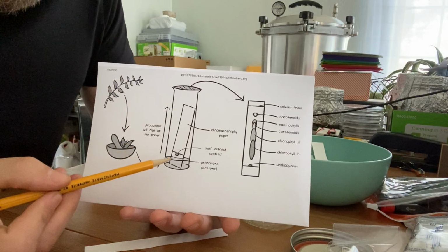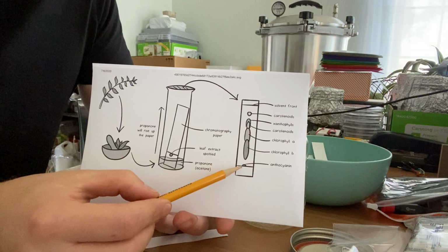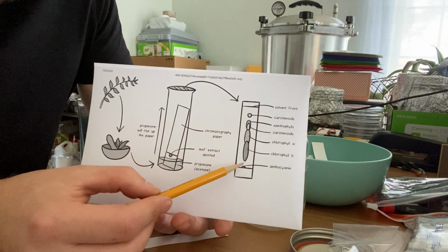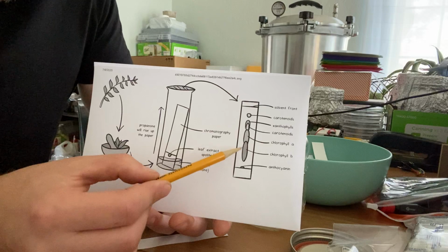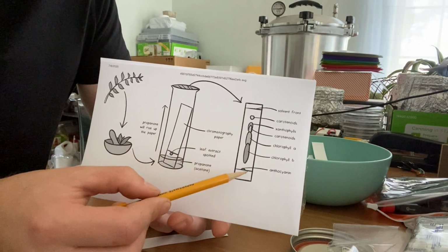And we're going to be, what's TLC? Like, what's the point of it? Well, it actually separates out the compounds that are present within the particular subject matter here. In our case, we're going to be taking a leaf extract, separating out its constituent components, and that way we can actually see what's inside of that extract.